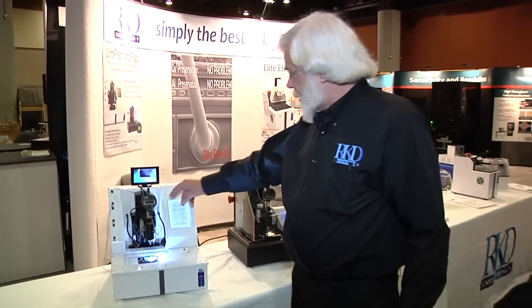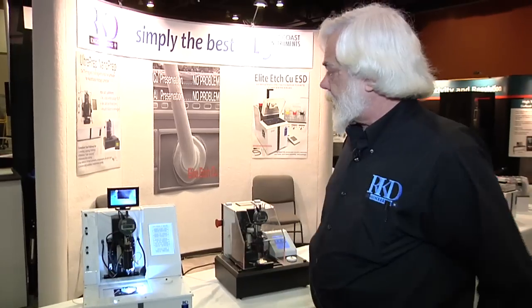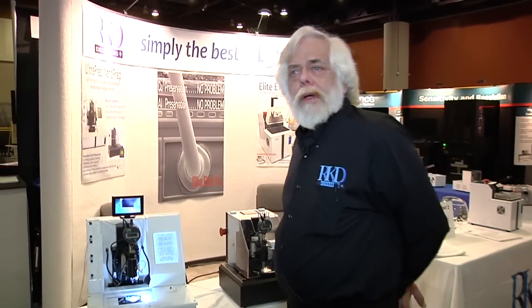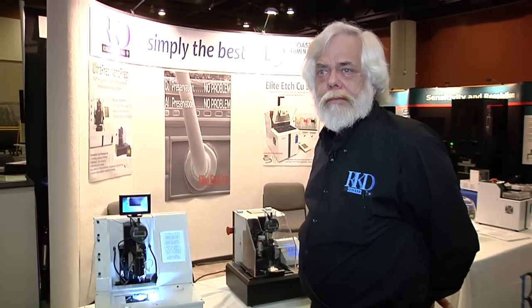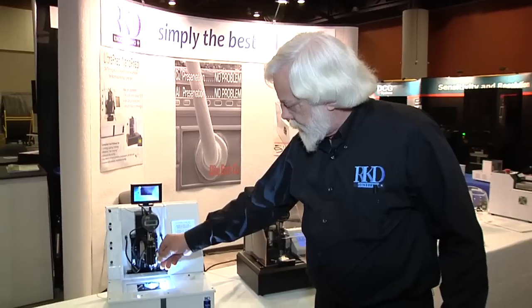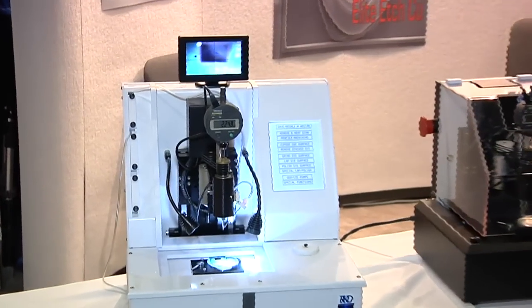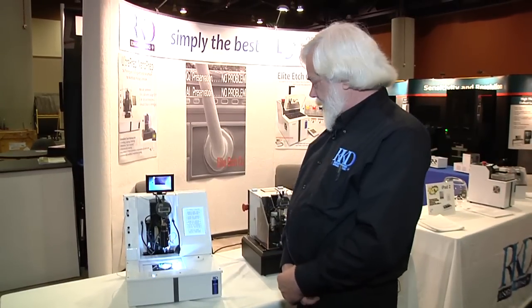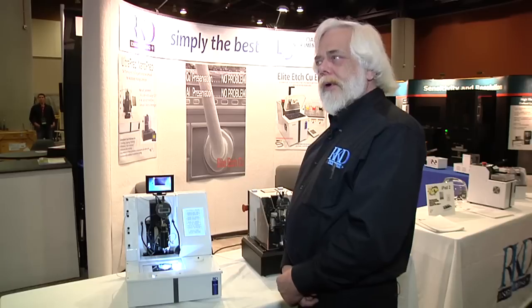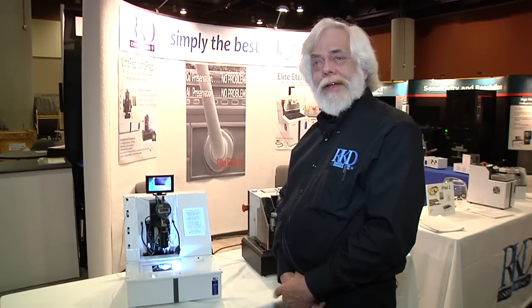The machine can be supplied with a series of peristaltic pumps to supply lubricant, slurry, or even CMP type materials to the tool being used. All of the processes the machine performs can run completely unattended. It only requires periodic tool changes and it doesn't break die.